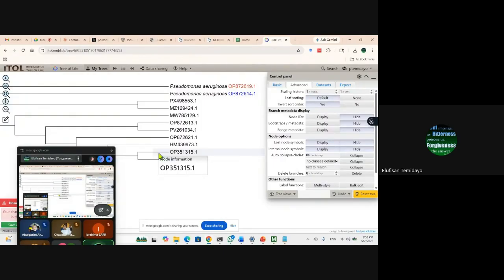Now, let me talk about clade now. Clade is just the branches that evolved from the root strain. Okay, so let's check what we have before. I think this is all I can talk about iTOL. I'm not too familiar with iTOL. I use it, but I'm really not too familiar with it, and you could see the way I was working with it. But just because I have a basic idea that we can still work with it, I said, let me discuss. I think we can just work and move on from there.